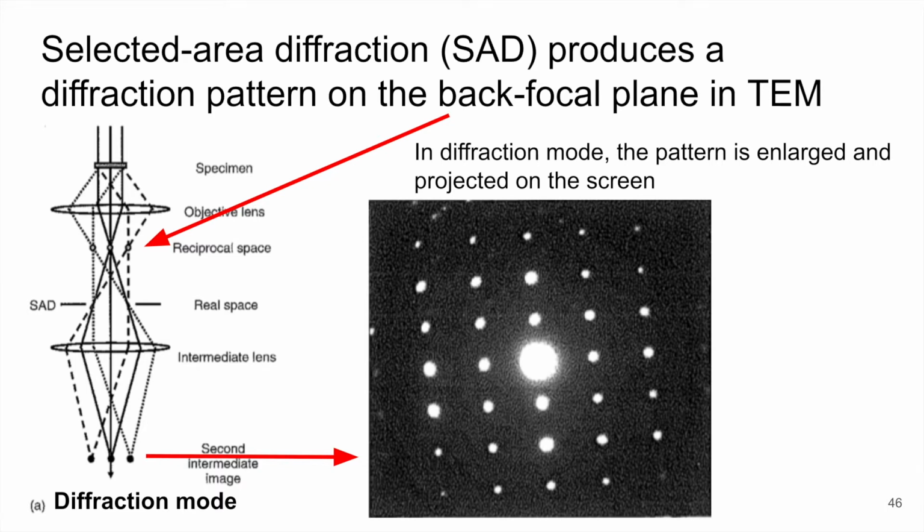So all of this that we've talked about with this HRTEM again relies on us being able to produce a diffraction pattern like we saw in diffraction mode. So this is just a similar image to what we saw. And so the setup is slightly different.